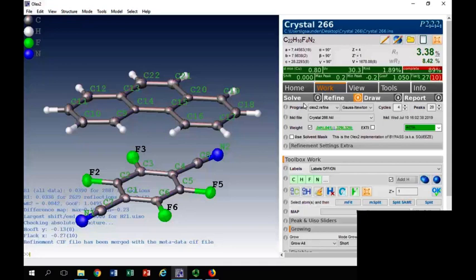I think that's about it. That's what you need for your assignment. Okay, so it gives you an idea of what's used, what we do when we solve a crystal structure, what's involved, how you get to the end. Another thing you should write in your assignment is talk about the quality of the data. I've indicated it through the lectures what parameters we look at. Are any of your thermal ellipsoids looking horrible? You might want to point that out.